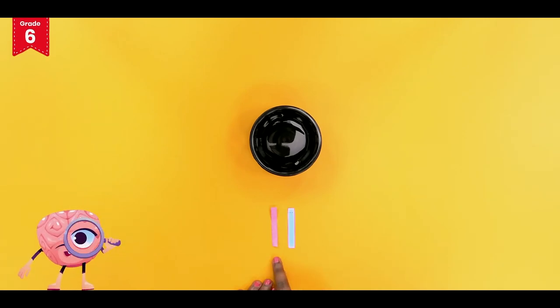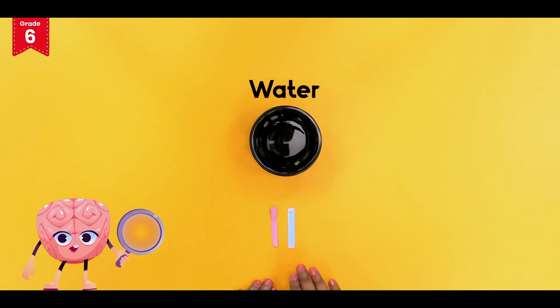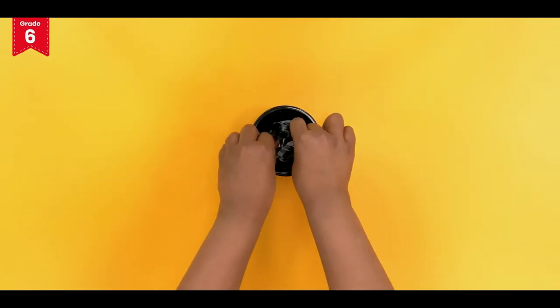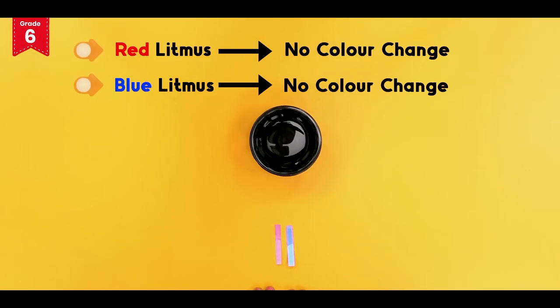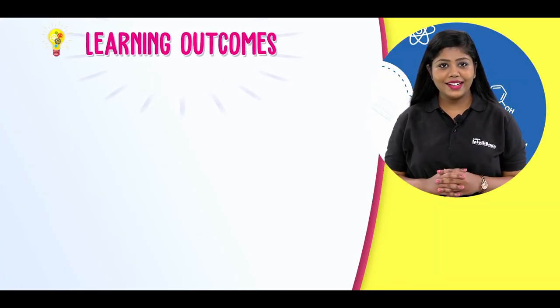Now dip 1 red and blue litmus strip in the bowl containing water. Keep it aside. There is no color change in both the strips. Can you tell why did this happen?